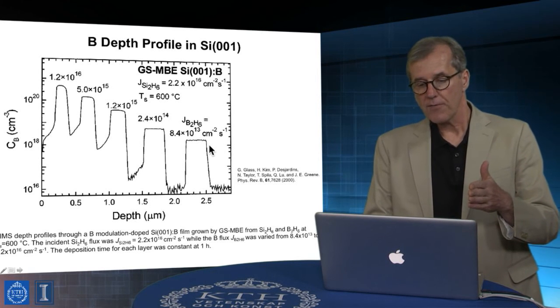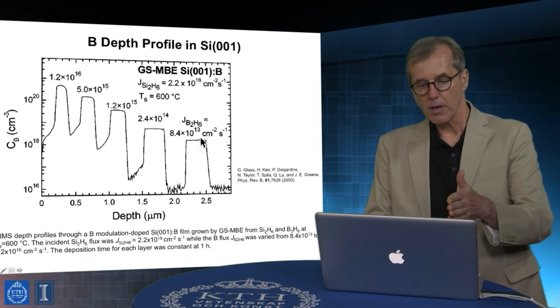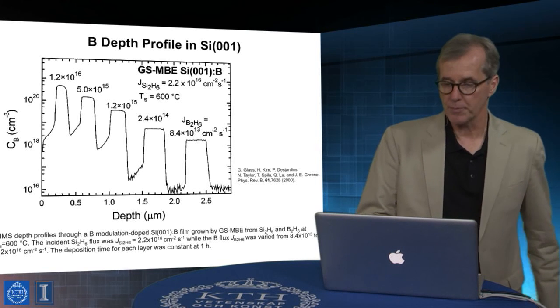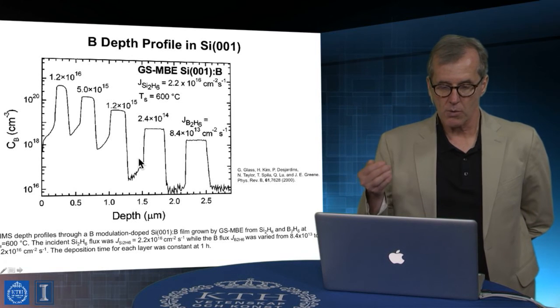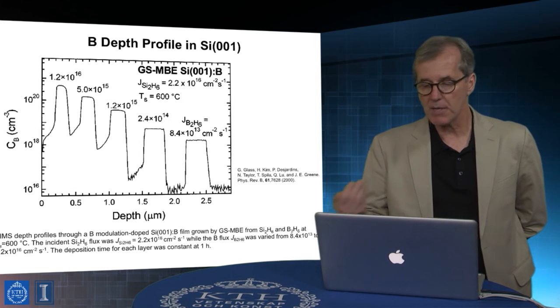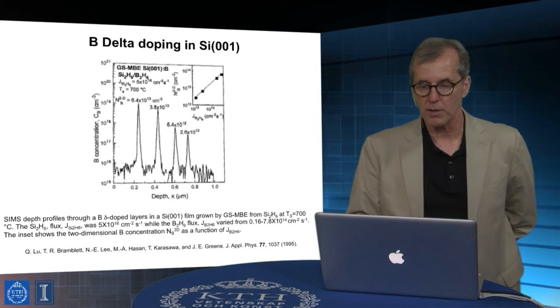And so we can follow dopant profiles, right, from here to here that vary by 3 orders of magnitude, right? And so this gives you a very rich and powerful way of looking at dopant levels in semiconductors, and this can be carried over much more broadly into other classes as well.